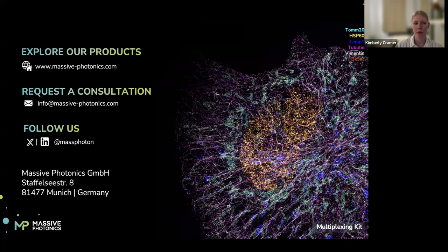Yes, you could do this. There are different ways to design the docking strand. For example, if you need some sort of signal amplification, instead of having one binding site for the imager, you could have 10, 20, etc. This is one way you could amplify the signal for a super low copy number target if you don't see it already.